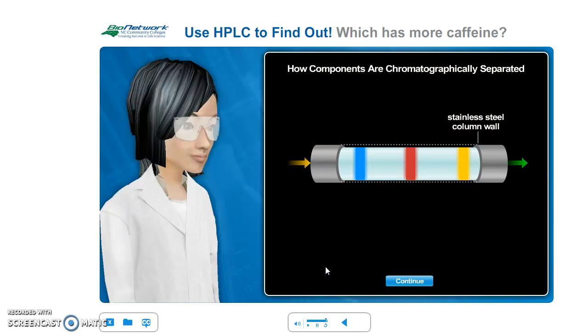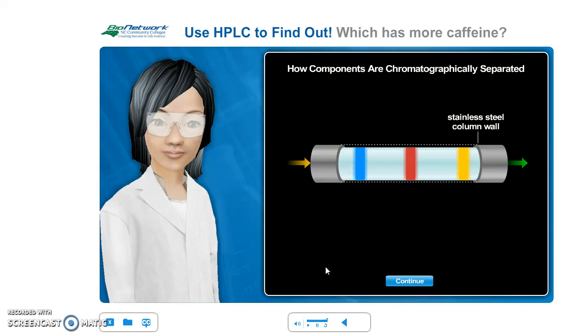When you are ready, click the Continue button and drag the waste container over to the diagram to wrap this up, okay?